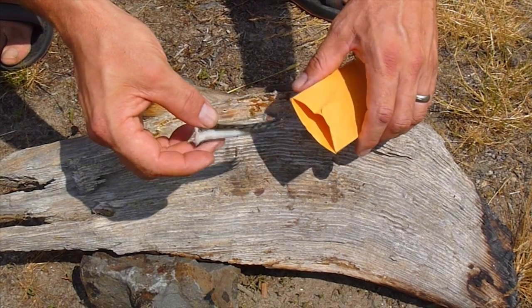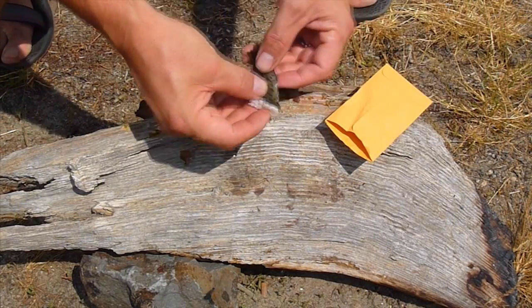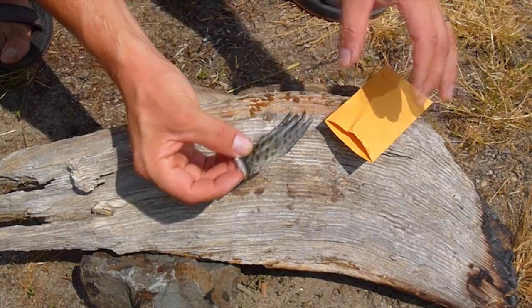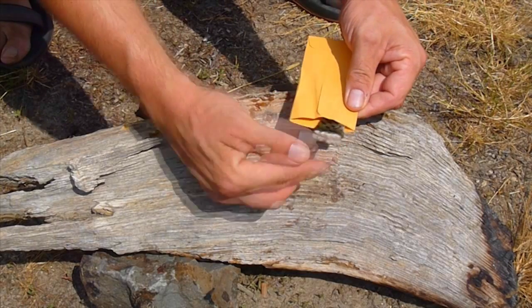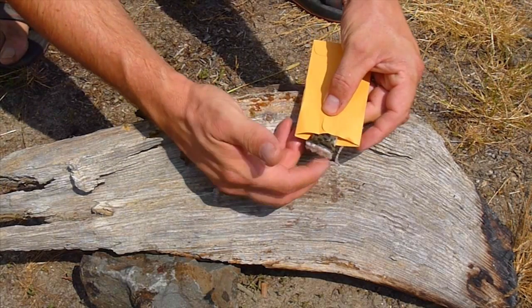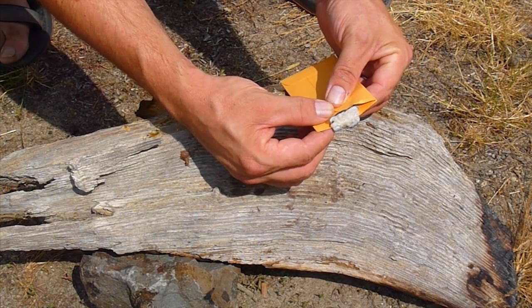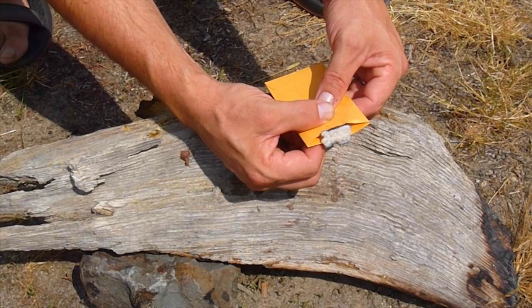The last step in collecting a fin ray is to place it in the envelope. It's very important to get the fin rays perpendicular to their bases — you want to see that orientation when you insert this into the envelope. Put the fin rays in the envelope, drag the bases in that direction, spin it a little to get it in position, then push down. The base of the fin rays should be exactly like that. There is no need to close the flap — just leave them exposed, mash down the paper so it kind of glues it together and keeps it in one place, then go ahead and stick it in a plastic bag.